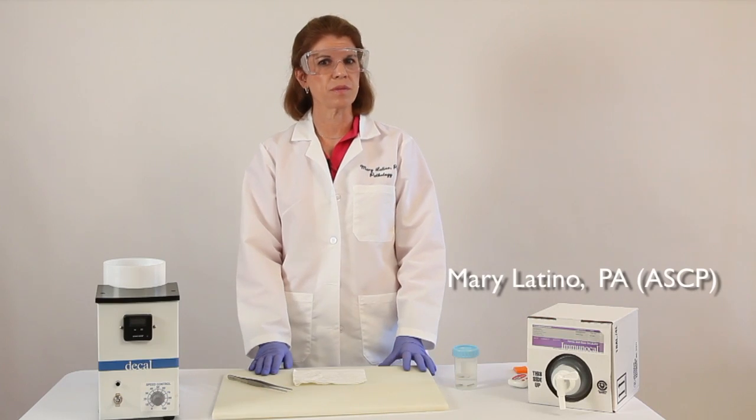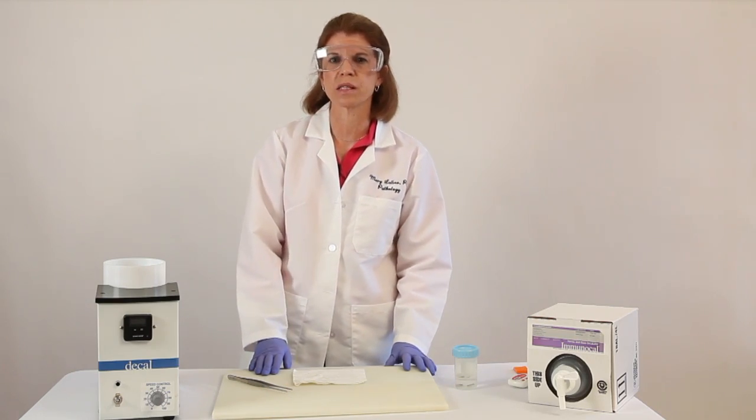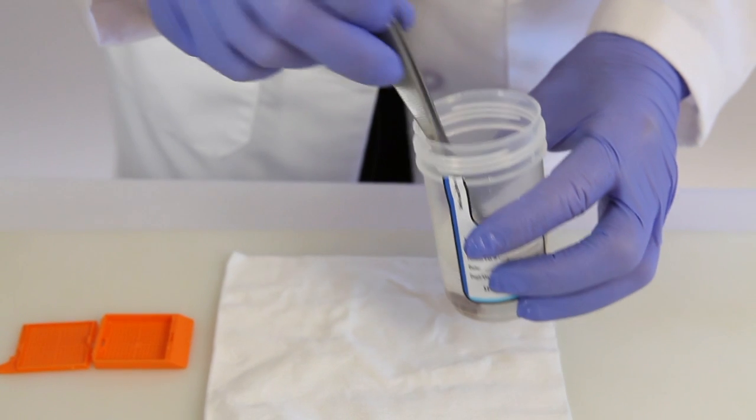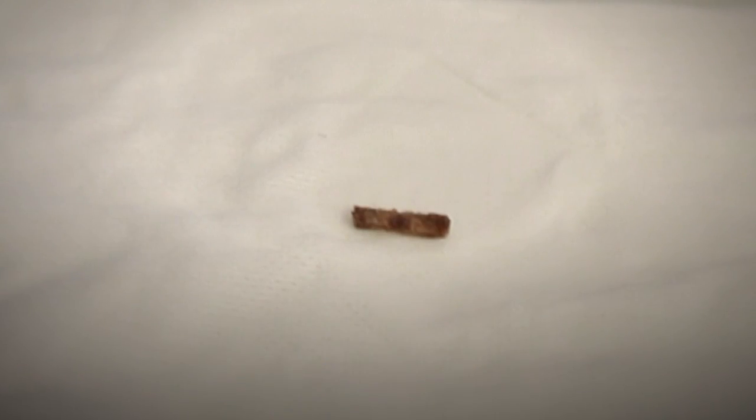I'm Mary Latino here with some tips for decalcifying a bone core specimen. As you can see, they're typically cylindrically shaped like this one because they're taken from a bone marrow using a needle.